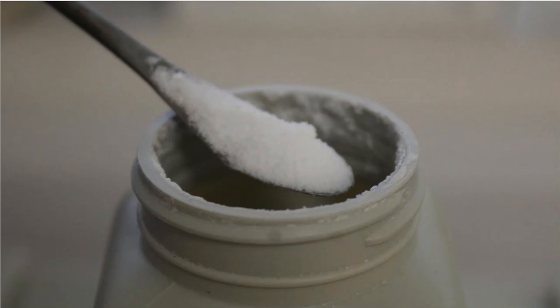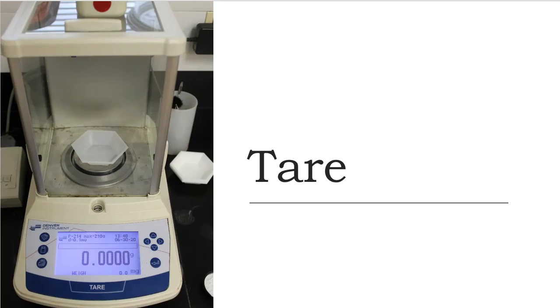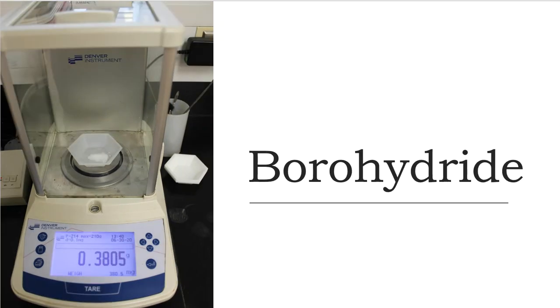Here's maybe a little bit better picture of what sodium borohydride looks like. Once more, I need to weigh out or measure a certain amount of mass of sodium borohydride for the reaction. So I go to my balance yet again. I tare it out, 0.0000, and I add borohydride to the weigh boat, and I end up getting 0.3805 gram. All right, so close enough.